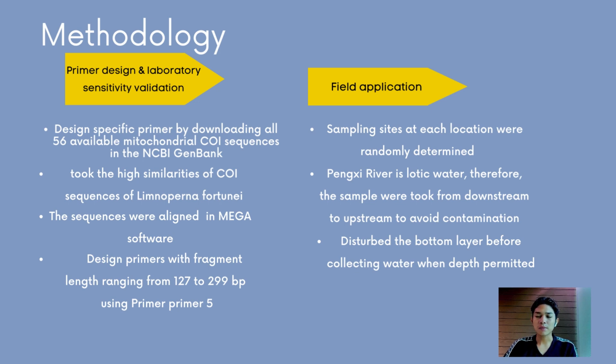Then take the high-similarity CO1 sequences of Limnoperna fortunei. The sequences were aligned in MEGA software, and then the primer was designed with fragment length ranging from 127 to 299 base pairs using Primer 5. The next step is field application.